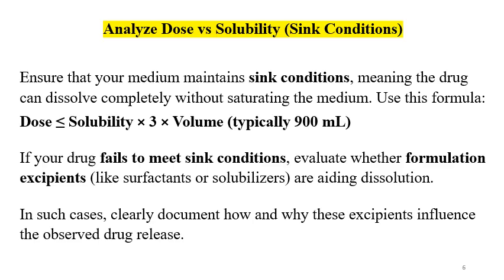Sink condition considers the dose, the highest strength of the formulation, and if we achieve the sink condition, then we can justify that the dissolution is reproducible and dissolution variation is not because of lower solubility. We can say the sink condition is achieved when the media and media volume are capable of dissolving 3 times the dose of the drug compared to the highest strength. If sink condition is not achieved for low soluble drugs, we can use surfactants.